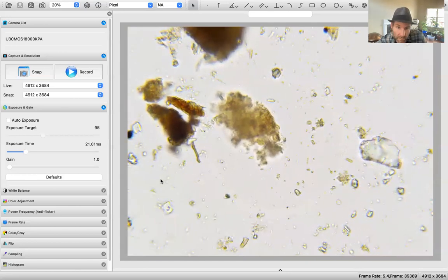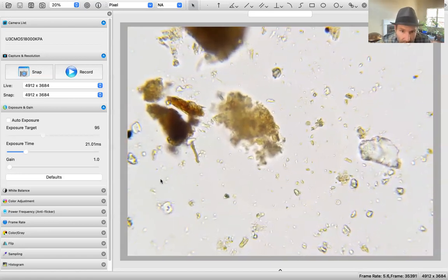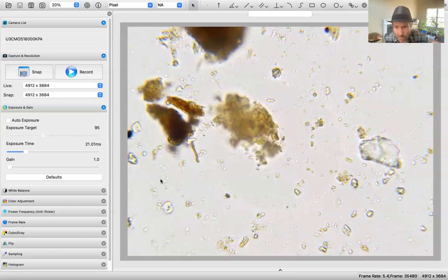It looks like a little piece of fungi. Yeah, it is not uniform. It's all lumpy. The outside walls are not uniform. That's organic matter. It does have a relatively clean break, but I'm not counting it. If it is a fungi, it's dead, so it doesn't matter anyway. That's the way I see it. It's organic matter.